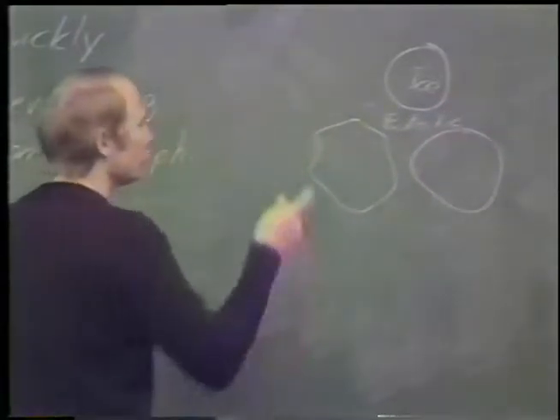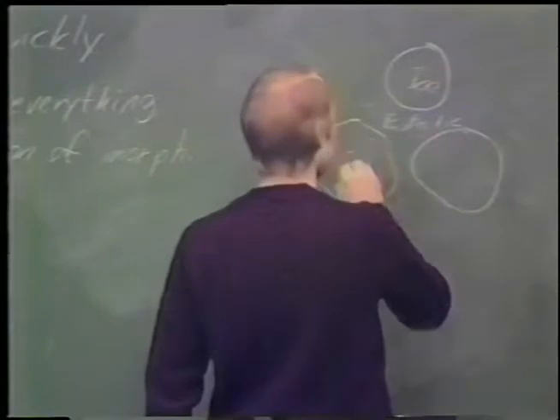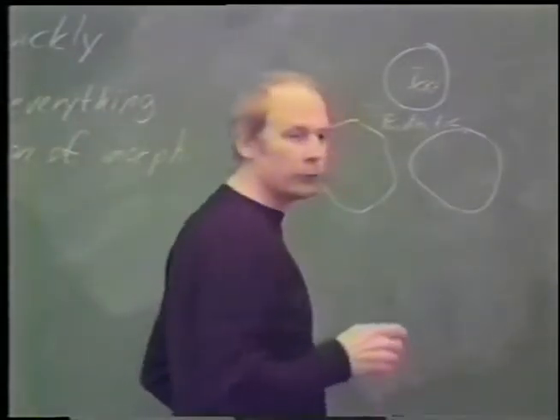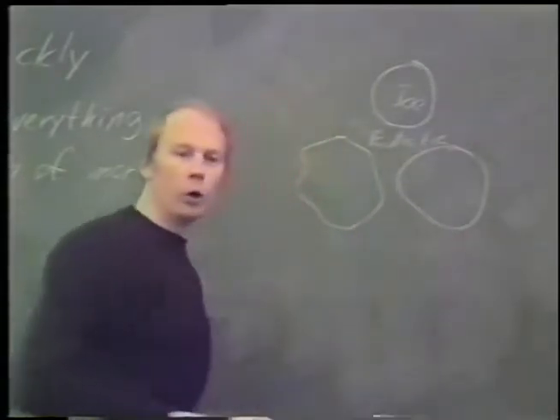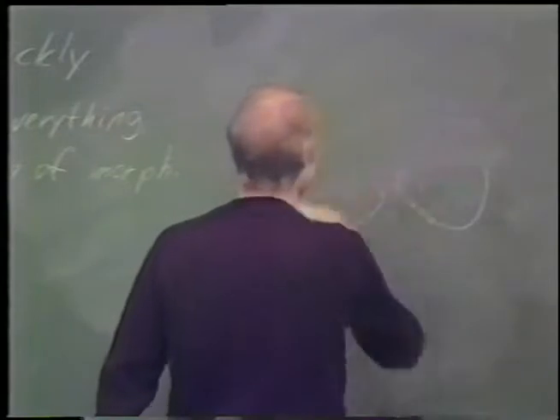And this shows up in freeze fracture preparations, especially if you etch a little bit, as smooth etched domains surrounded by raised ridges where the eutectic is. The eutectic does not etch as quickly, so it's easy to recognize. In a freeze substituted preparation, what you see is a reticular network of the eutectic surrounding holes where there was only water. So this artifact is easy to recognize, and I have some examples of it. I'll turn on the projector, and we'll see if I've forgotten these slides in the meantime.